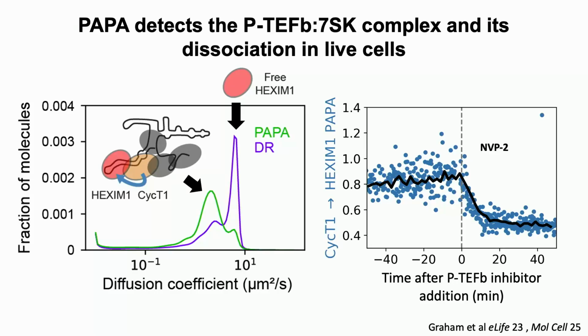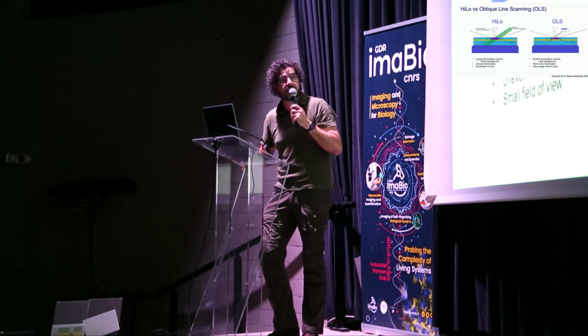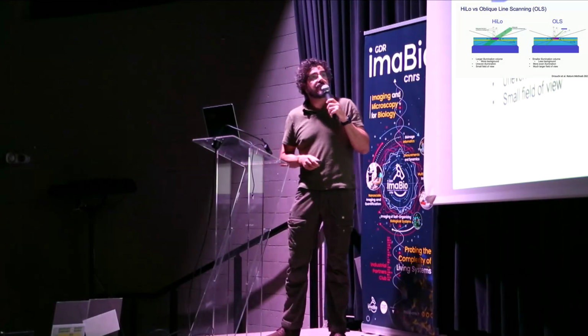So at the same time the lab was doing this, I also started a company, and in this company we decided to use these single particle tracking techniques to follow single proteins, to see if we can modulate the dynamics of these single molecules, these single proteins, with drugs, and whether we can discover drugs using our microscopes, right? So basically drug screening, screening libraries of small molecules.